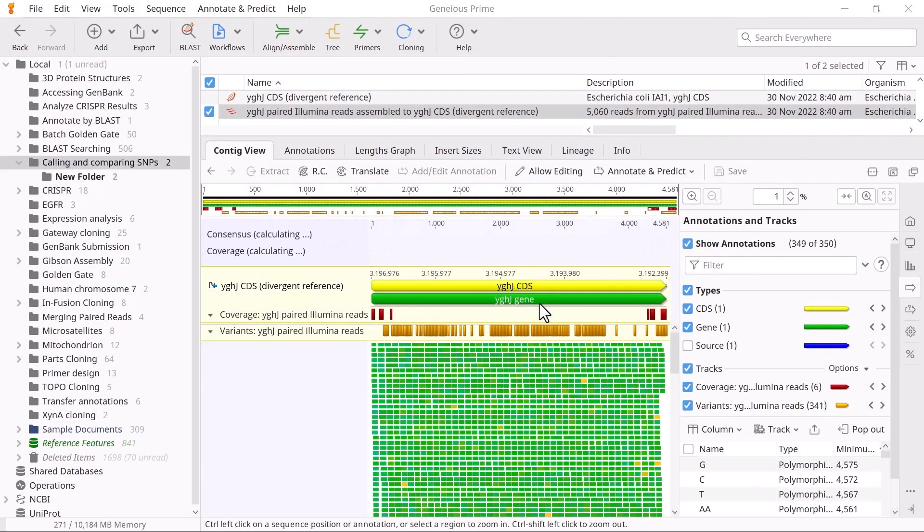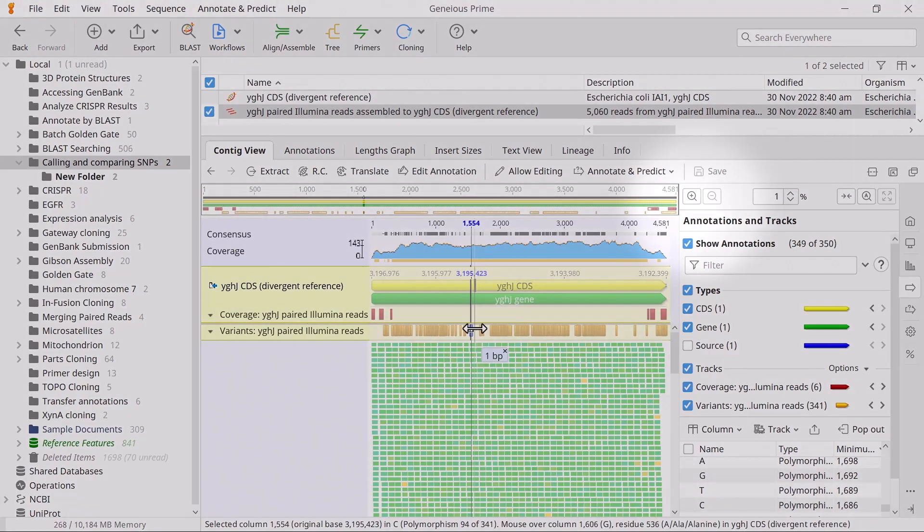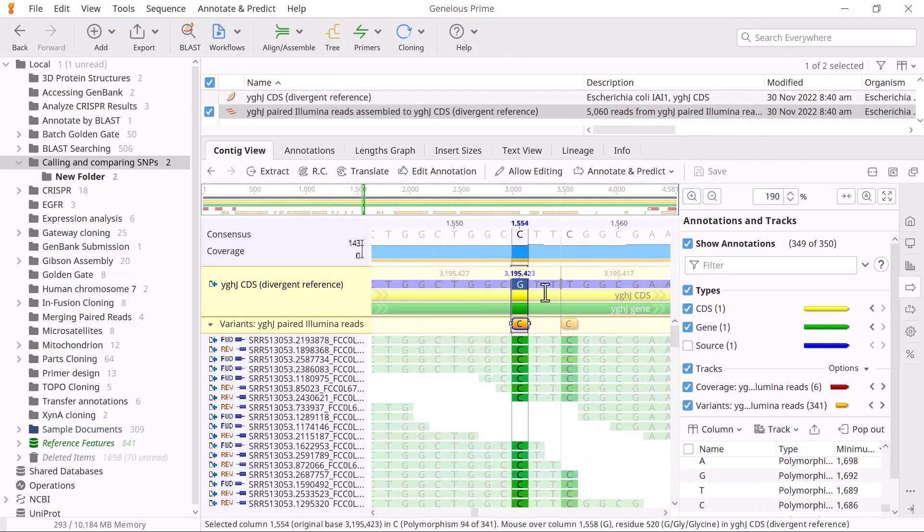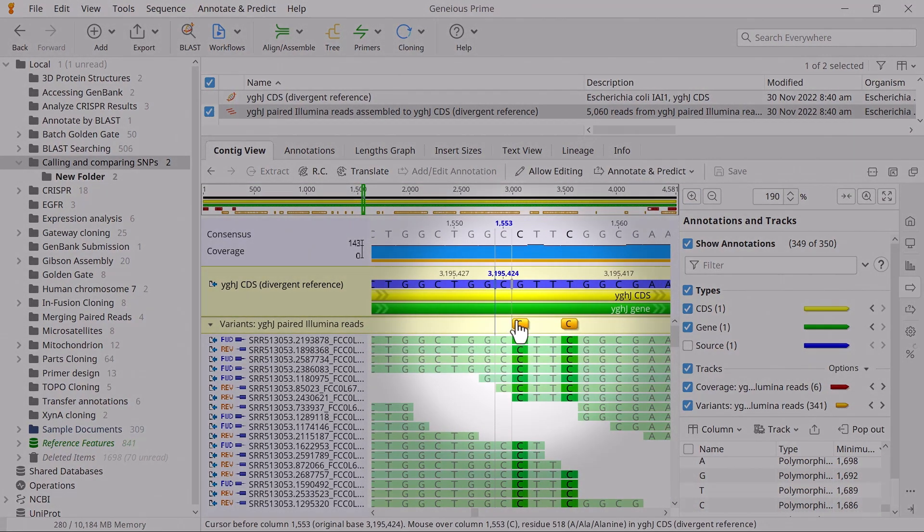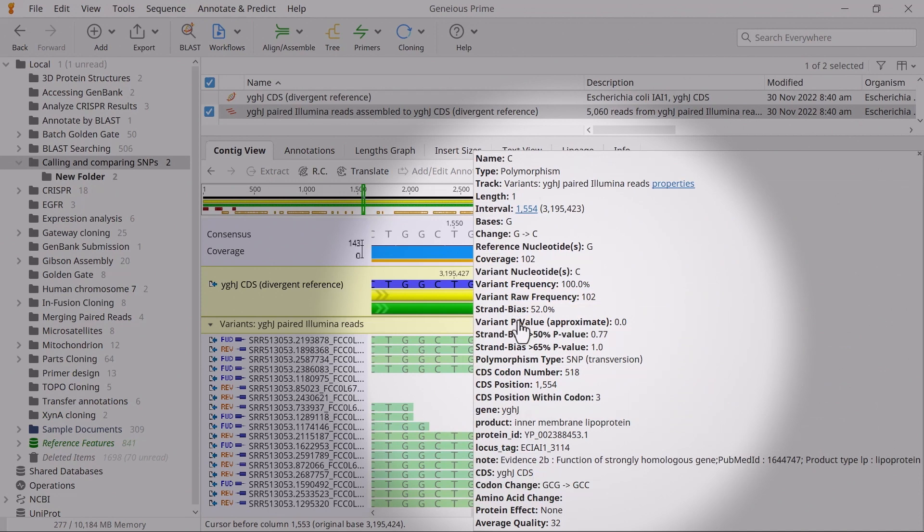To learn more about a specific SNP, zoom in on an annotation in the Variance track and mouse scroll over a SNP of interest. The pop-up window contains information for that SNP, including the base change, variant frequency, SNP type, and information about the protein and coding sequence changes.